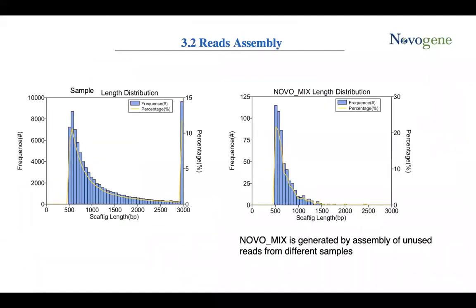It's actually the first step in metagenomic bioinformatic analysis is reads assembly. And after pre-processing, the clean data is obtained. Then we use the SOAPdenovo assembly software for assembly analysis. For scaftigs generated by single sample and mixed assembly, we filter out fragments below 500 bp and perform a statistical analysis and the subsequent gene prediction.